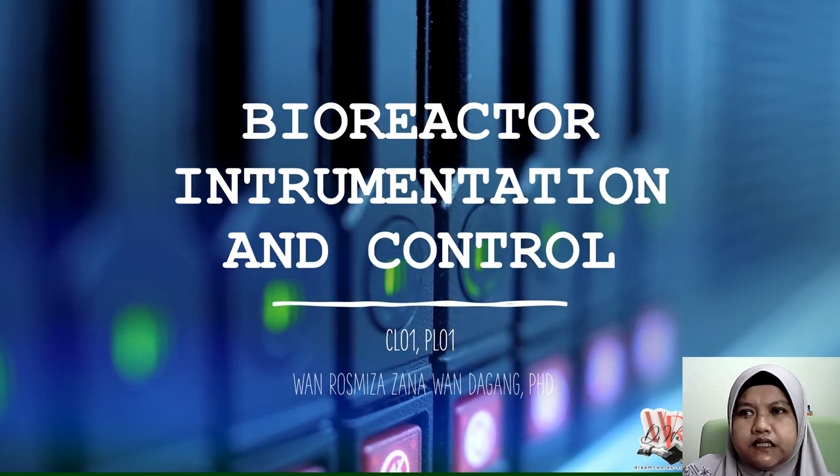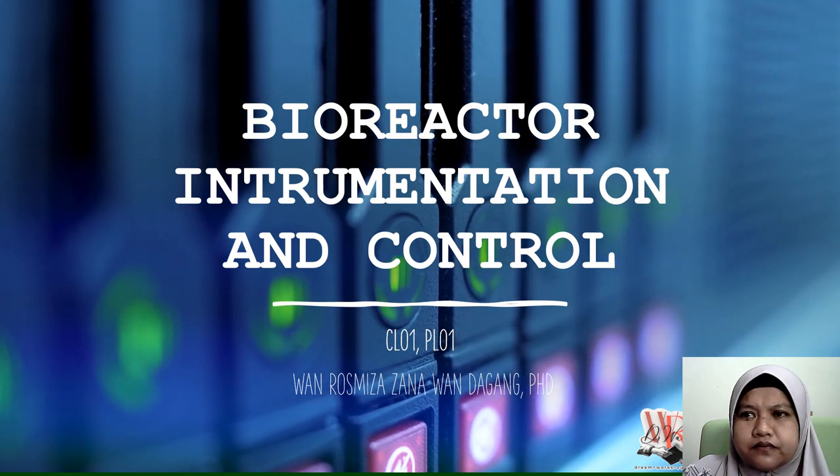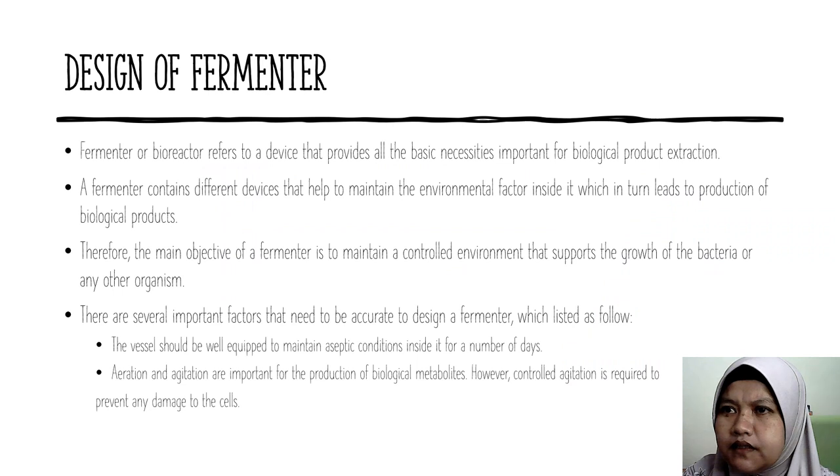Today I will give a lecture on bioinstrumentation and control. Design of the fermenter. The fermenter or bioreactor refers to a device that provides all the basic necessities important for biological product extraction. The fermenter contains different devices that help to maintain the environmental factors inside it, which in turn leads to the production of biological products.